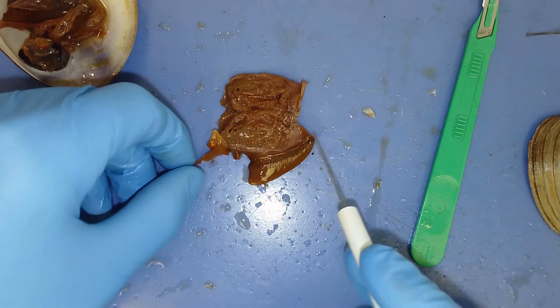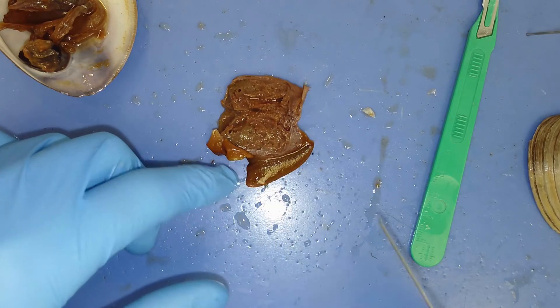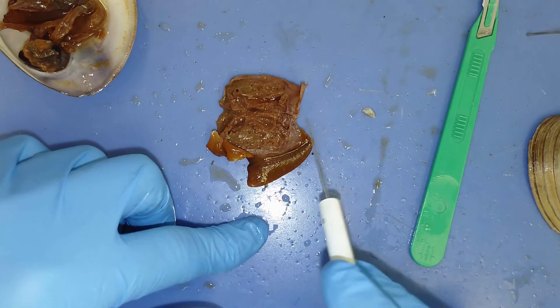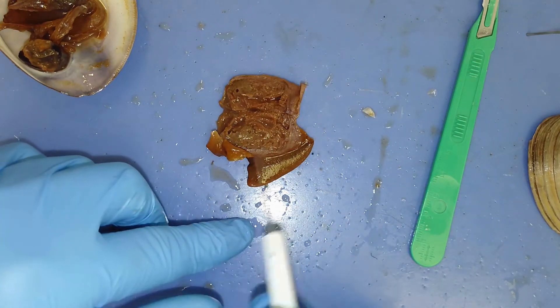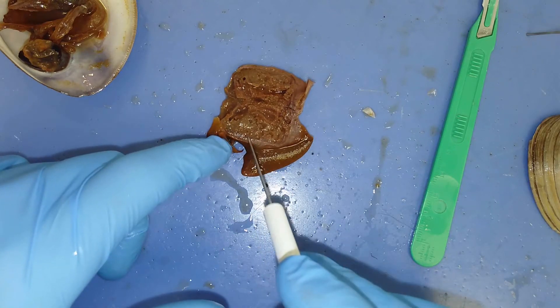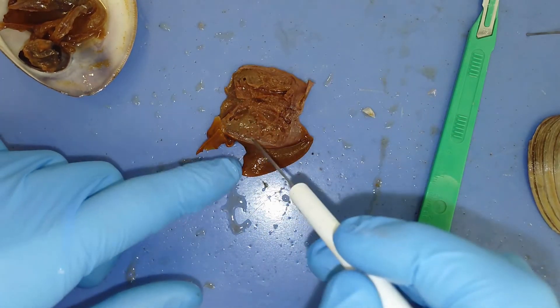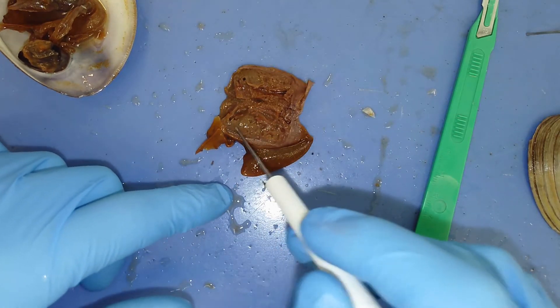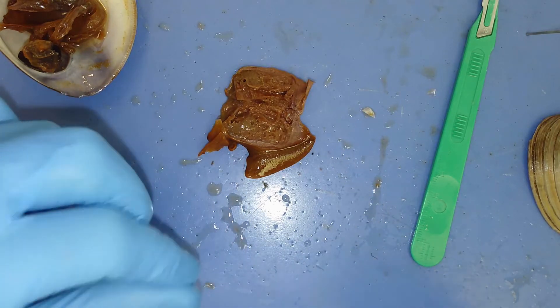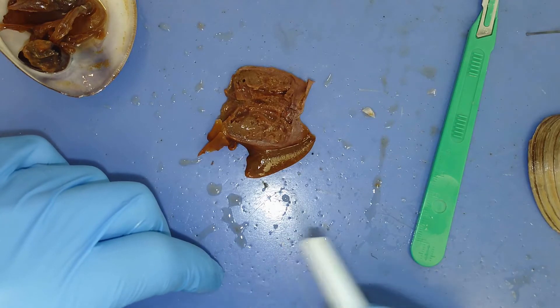Once we have this visceral mass opened up, you can see a couple of distinct areas or regions. This tube-like structure here is the intestine. That intestine is coiling from the incurrent siphon throughout this visceral mass until it exits out to the excurrent siphon right next to the anus. As it's coiling, water is flowing through it carrying food particles. Those food particles are digested in this green area on either side, called the digestive gland, which absorbs nutrients and secretes enzymes to digest food particles entering the intestine. Water then flows out the excurrent siphon just past the anus.